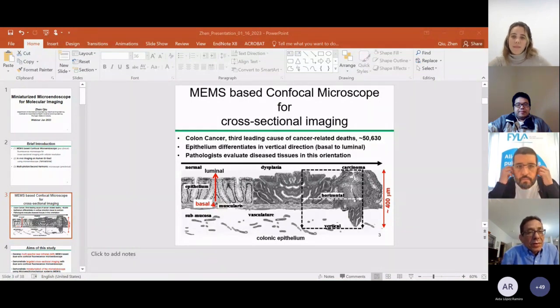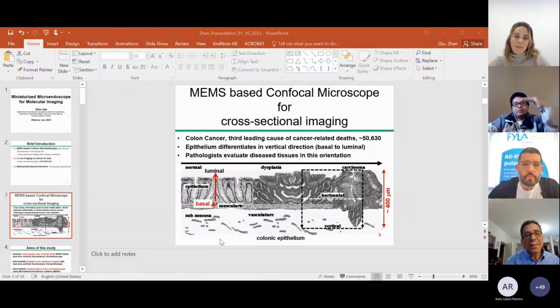Hi. I was wondering what the vertical resolution, the scan resolution of your MEMS is, and what is the lifetime? Okay, so the resolution right now is based on the optical imaging system rather than the scanner itself. The scanner can travel the whole Z 500 micron, but you're talking about mechanical resolution, not really optical resolution. Since we like to travel very largely, we use resonance scanning. So we run it at the resonance at the Z. We don't stop here.